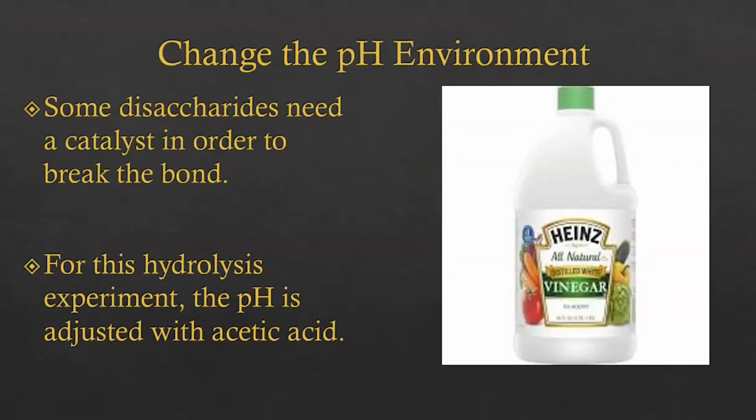Human digestion requires enzymes and acid to catalyze hydrolysis. In this experiment, the disaccharide requires a more acidic environment to break the bond. The pH must be adjusted.